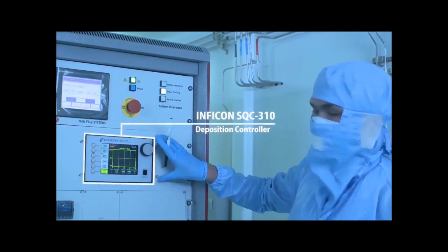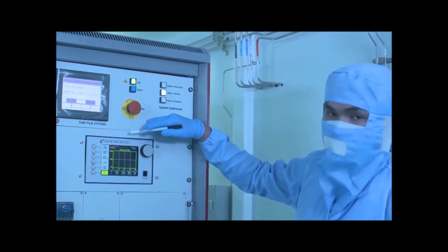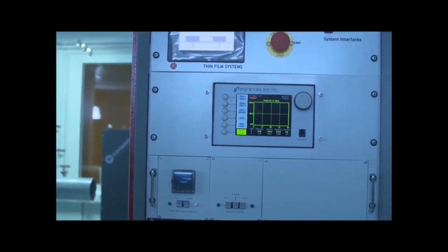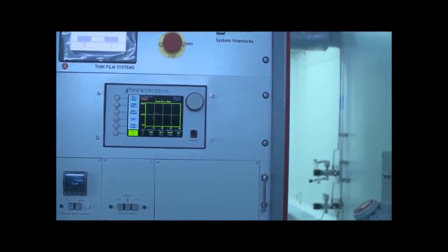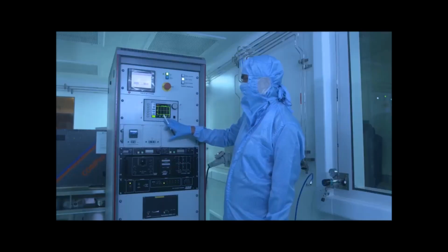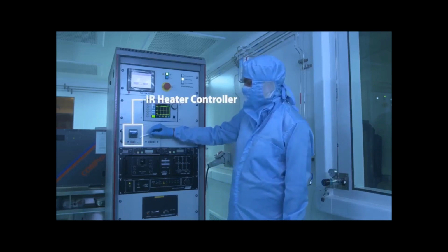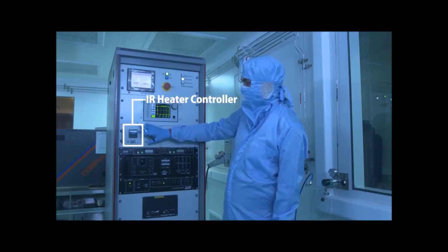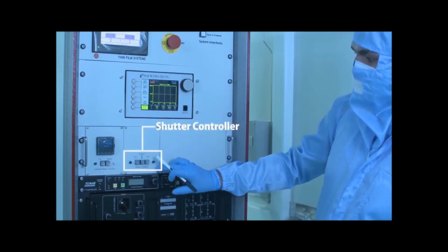This is just like the brain of our system. This is the Inficon SQC310 deposition controller unit. So we have to put the parameters required for deposition in this deposition controller. I will explain the parameters required for deposition during the deposition time. This is the substrate heater controller. So we can control what temperature we should give in the deposition chamber through the infrared heater. This is for the shutter control.